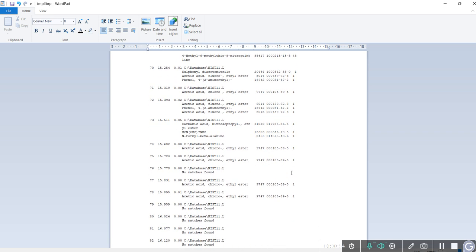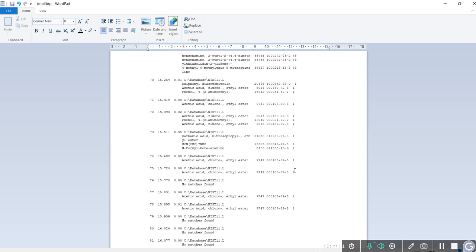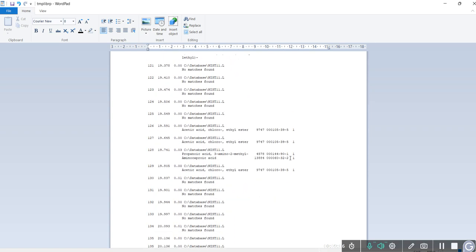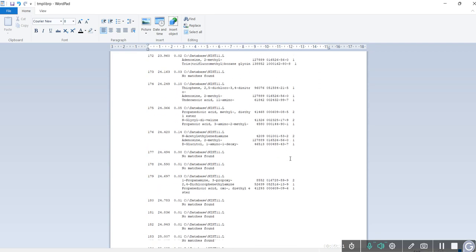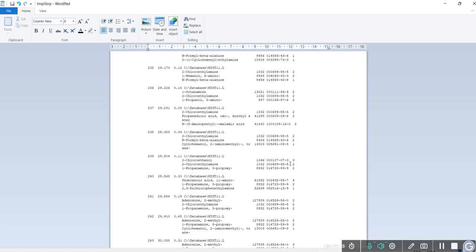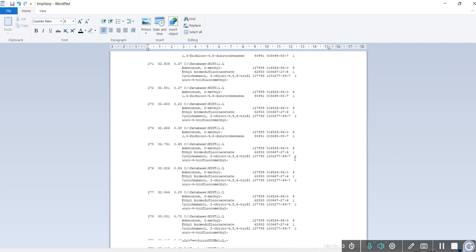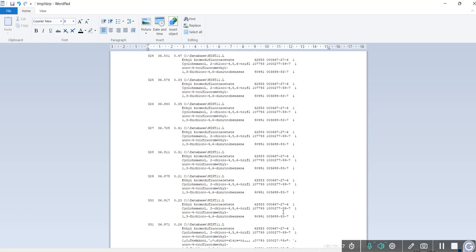Usually, in my case, when I want to analyze or to report, I will choose any compound that has a quality number of 80 and above. Which we just simply call true if we find other compounds. And there is some possibility we don't get a high match because we don't deduct the background. So for now you can see not many compounds detected at 80% and above.